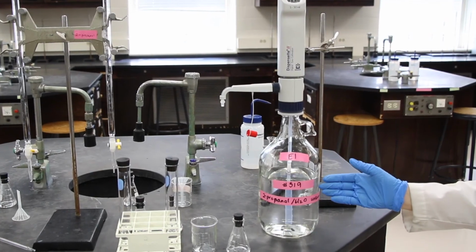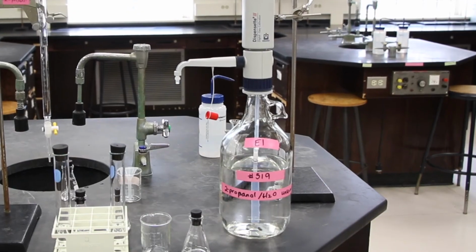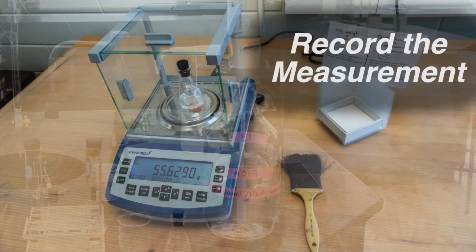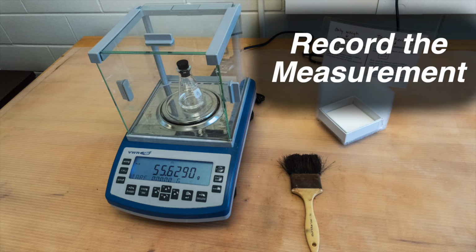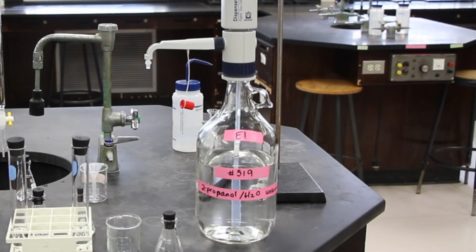While you're here, be sure to record the unknown number. Record this value on the data sheet, and also record the mass on the data sheet in the mass of sample and stopper and flask row. Calculate the mass of the solution from your data. Using this mass and the volume, calculate the density of the solution. Using the graph you've constructed, determine the mass percent water in the unknown. Pause the video while you're determining these values.